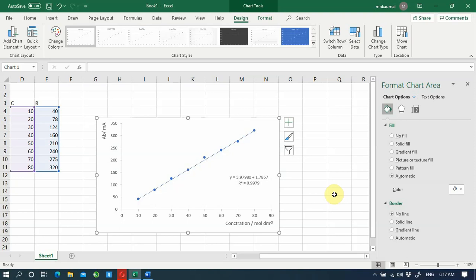So I hope you understand this. But when you do this, always check the given writing format. Now in the Department of Chemistry, we are using ACS style. So check the style. It gives you more information on how to draw a graph and everything. You can look at it and you can get the full idea how to draw a calibration graph using the style guide. We are using ACS style.